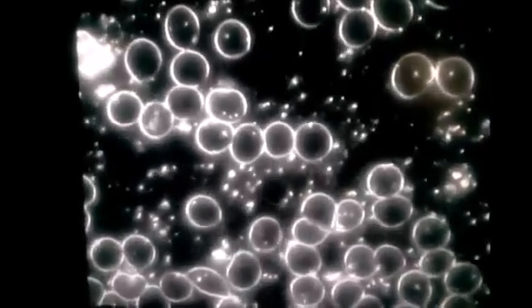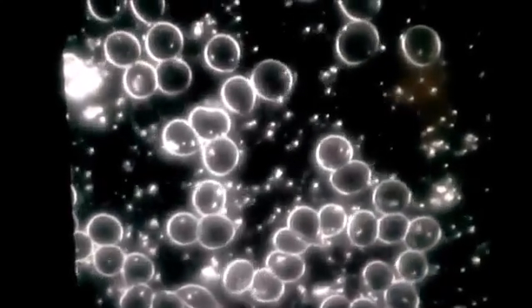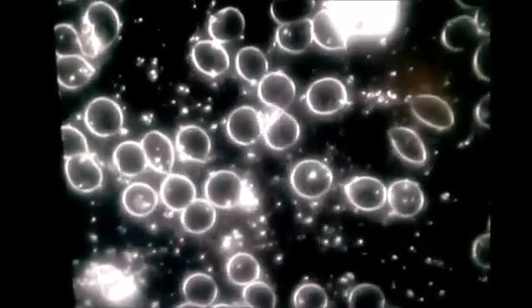Here we see the blood 15 minutes after taking the sole product. The red blood cells seem to be more clear. They seem to be more separate, moving around — don't see a lot of overlapping. Here we see a couple of white blood cells, maybe a little bit larger. You see several of them in one scan here. That lets me know that the immune system has been stimulated.